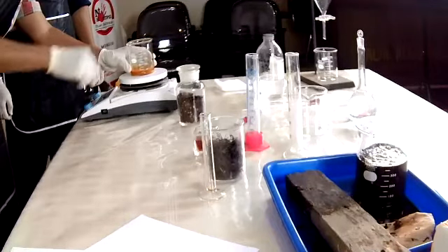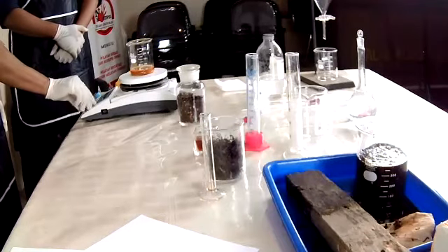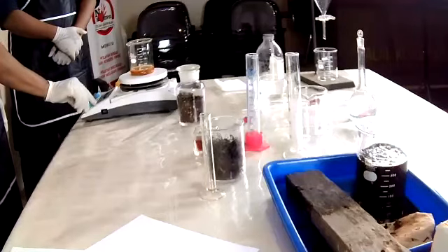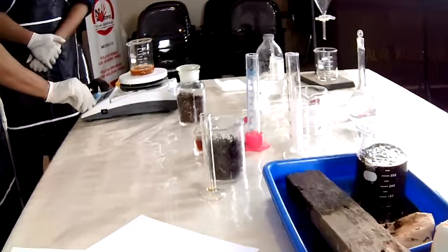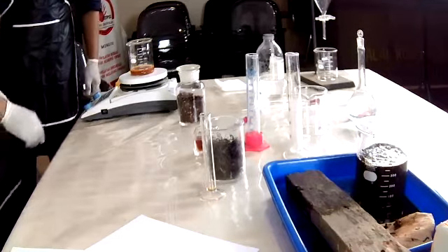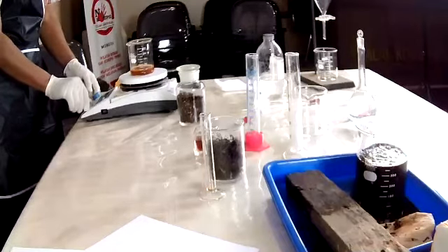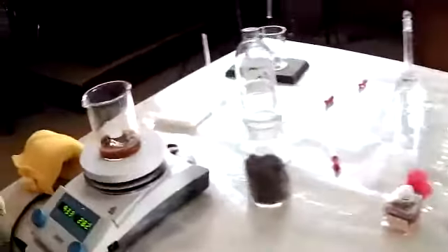So we put this in the glass here: 10 milliliters of the extract and 30 milliliters of the sodium hydroxide. It's a spontaneous, fast reaction here.